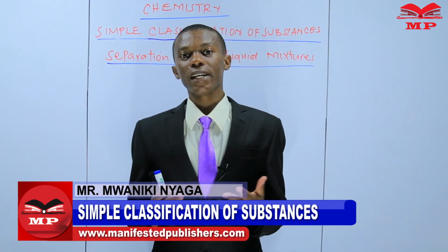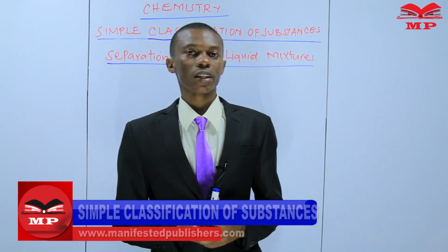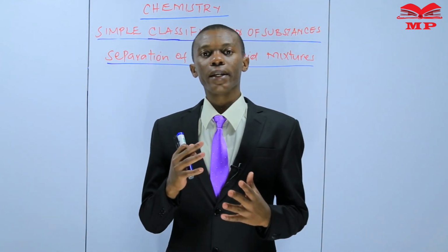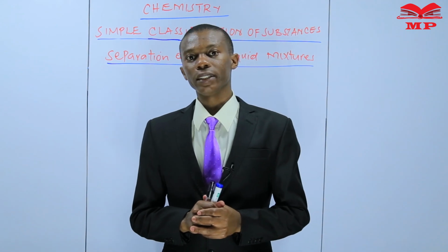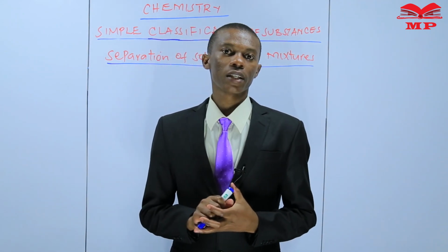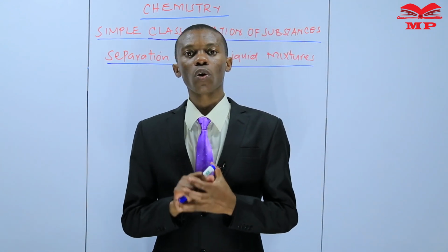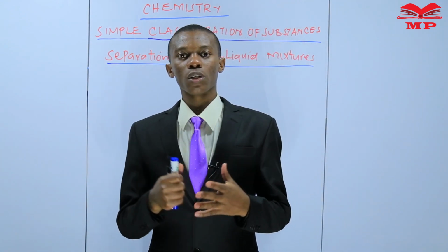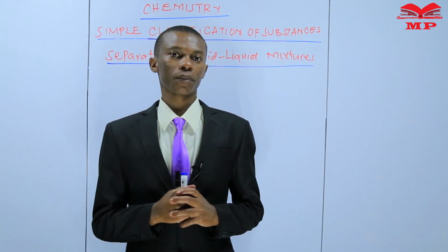Remember, the program is still Manifested Online Lessons. We are still learning Chemistry Form 1 and our topic is simple classification of substances. The subtopic is separation of insoluble solid liquid mixtures.